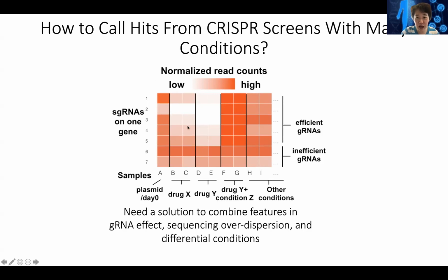And then we look at how they do, supposedly the students are taking the same course. We're trying to decide whether a professor is teaching well, meaning whether this gene is being positively selected or negatively selected in a CRISPR screen. At the same time, we try to also decide whether the student is a good student.